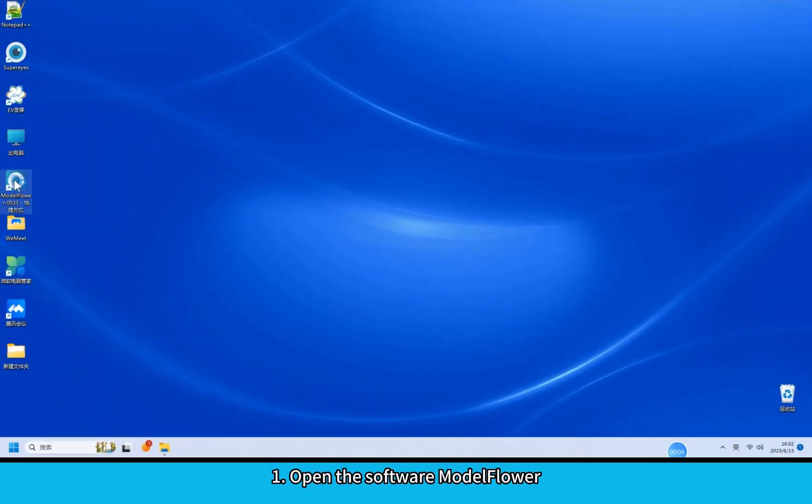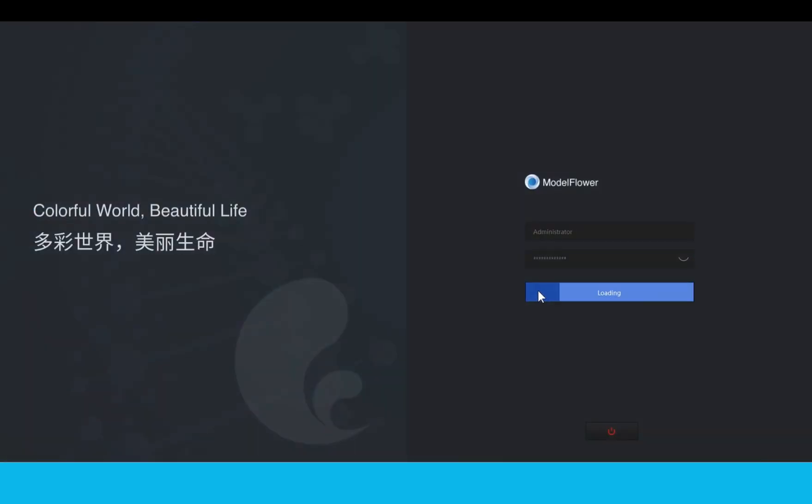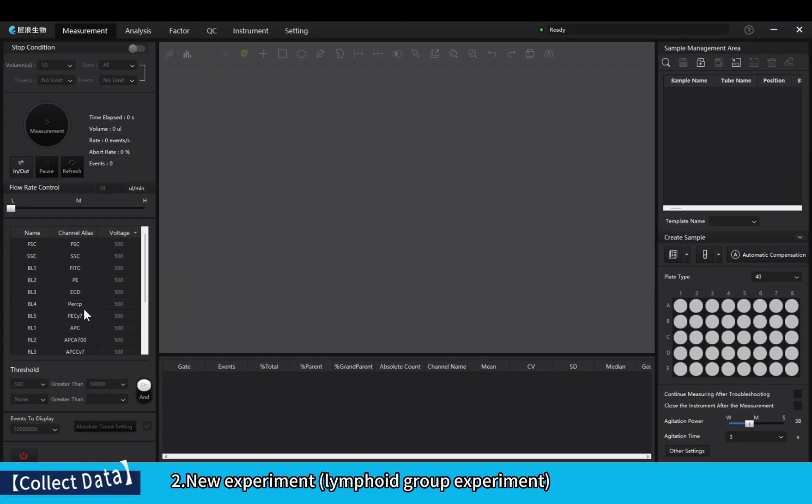Open the software ModelFlower. New experiment: lymphoid group experiment.